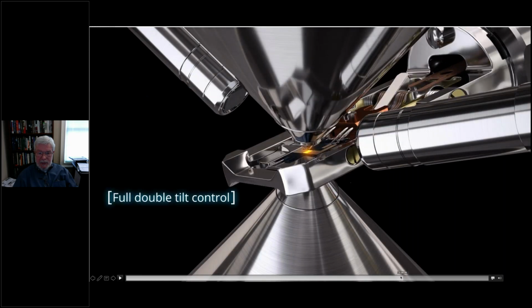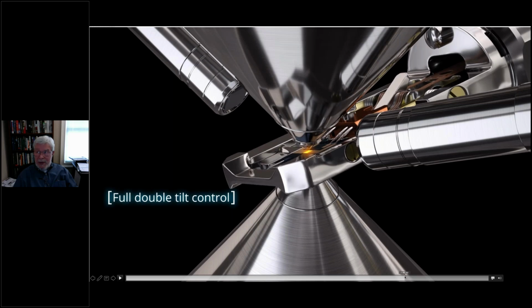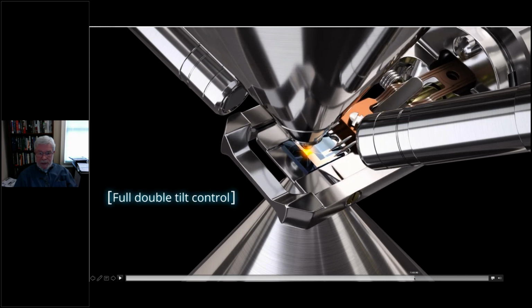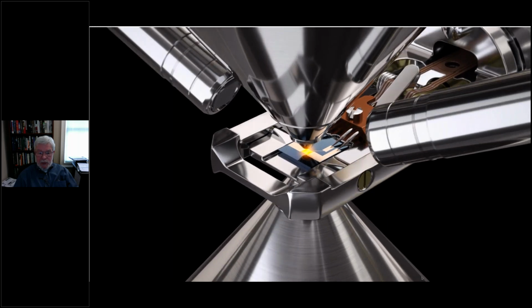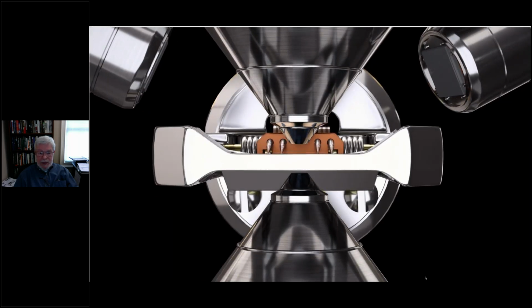And there's the double tilt mechanism, plus or minus 14, I think 14 degrees tilt in the beta tilt, and similar in the other axis, so there's large tilt. I should mention the JEOL 2200 FS only has a 2 mm gap pole piece. So all of these holders fit nicely in that microscope and allow a lot of motion because of the beautiful design.